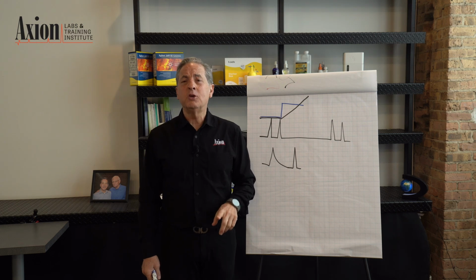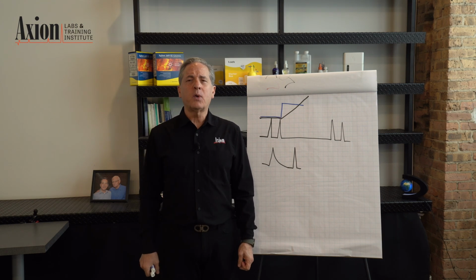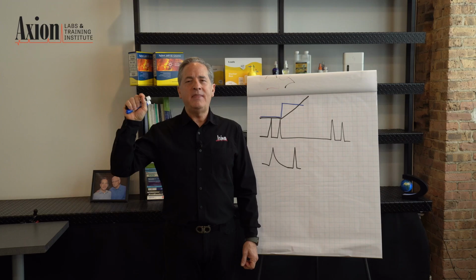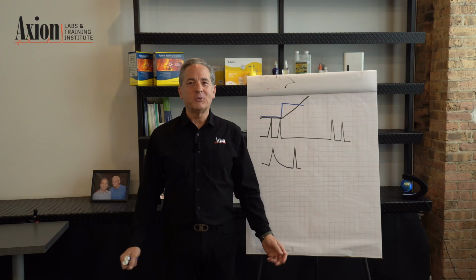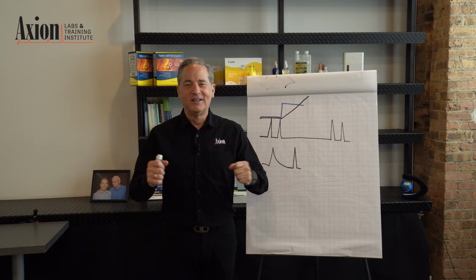You will find this in your method. So go to your column, whatever the column part is in your software, and under column, you'll have a flow versus pressure, constant flow, constant pressure, and it'll highlight one versus the other, and that is how you determine what mode you're running in. So everyone, switch to constant flow, ready now, and I promise you won't be disappointed. Great question.